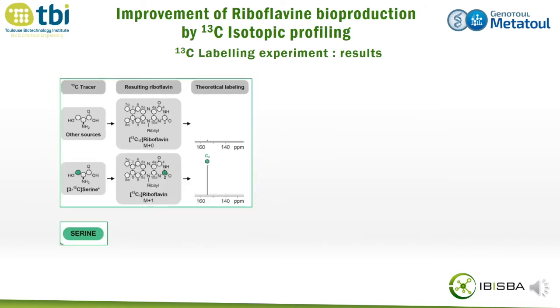When we have a look at the serine experiments, again in the medium we could have unlabeled carbon sources, leading to no C13 enrichment, and labeled serine added on position 3, leading to a C2 enrichment. And what we can observe experimentally is an enrichment of the C2 of around 11%.